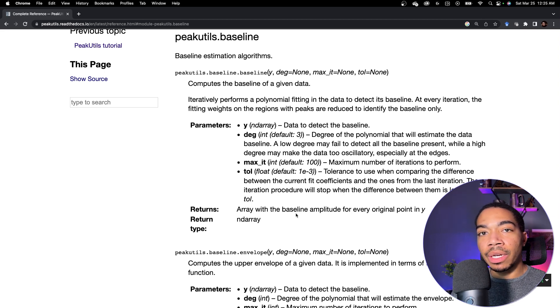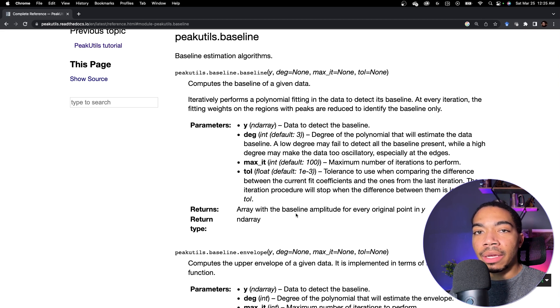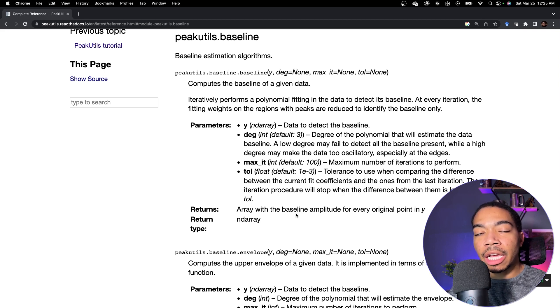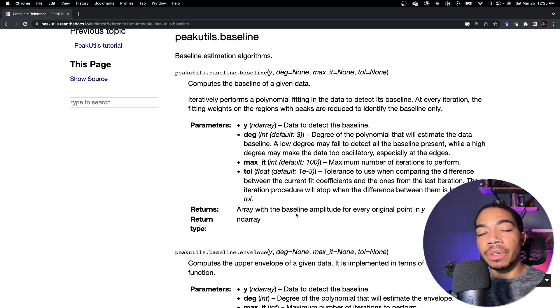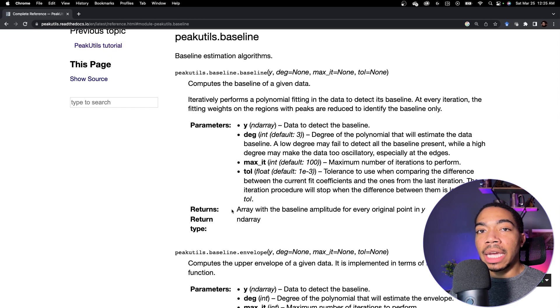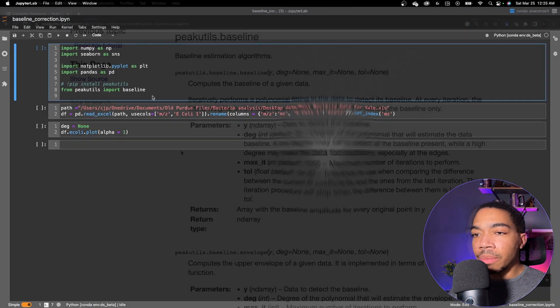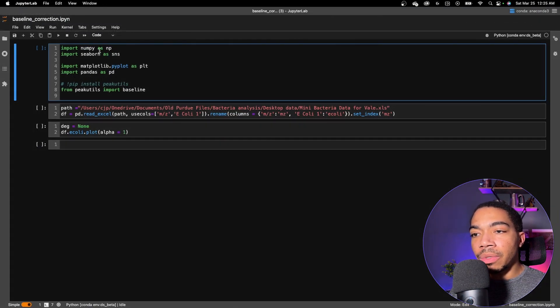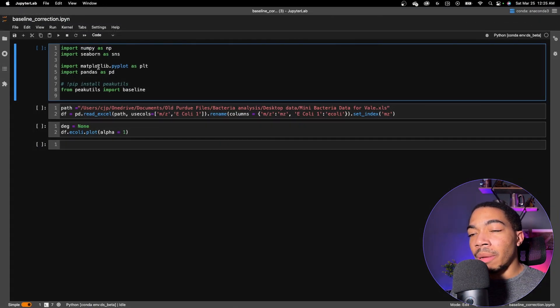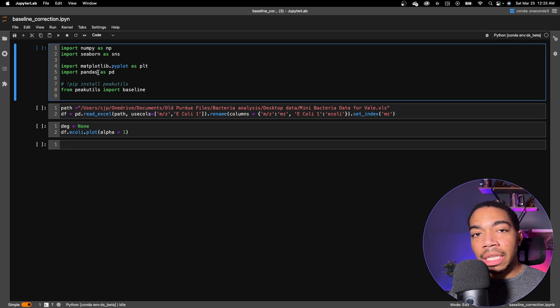And then it returns a NumPy array with the baseline amplitude for each original point in y. So when we want to do the baseline correction, we will subtract the array from this output from the original data and have our baseline corrected data. If we jump to the notebook, we will use NumPy, Seaborn, Matplotlib, and pandas in the typical fashions.